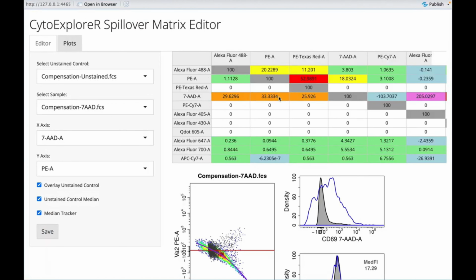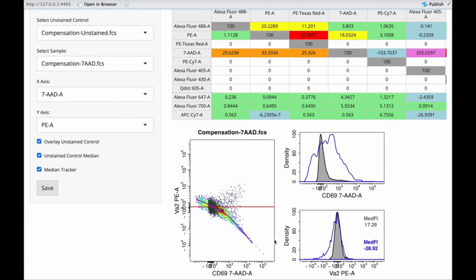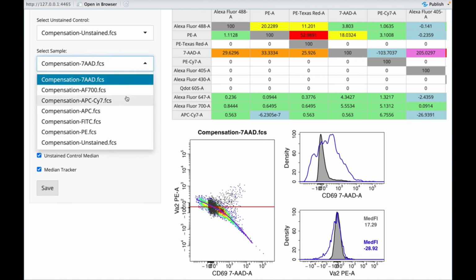For instance, you can see all the values have been written over here, and these plots will be created if you have installed OpenBLAS and LAPACK, which I mentioned in the beginning. For the graphics rendering, the BLAS package is really necessary, otherwise it will throw an error. Okay, so you can compare all the samples.